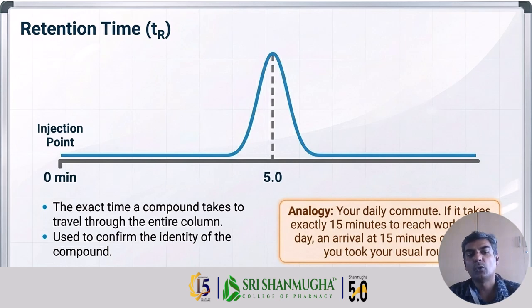Now that we know what the compound is, the next question is, how much of it is present? For that, we look at peak area.